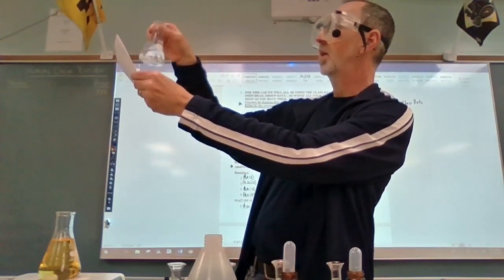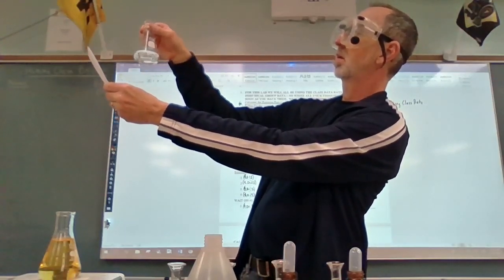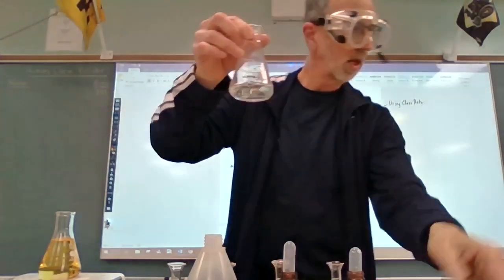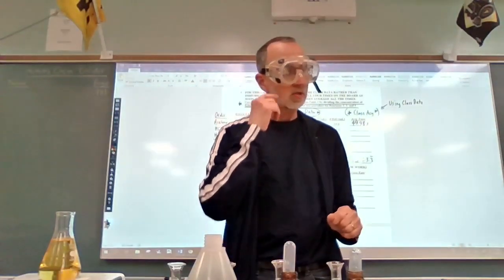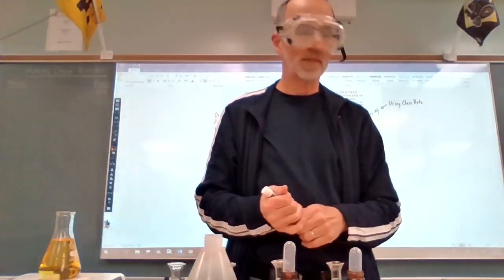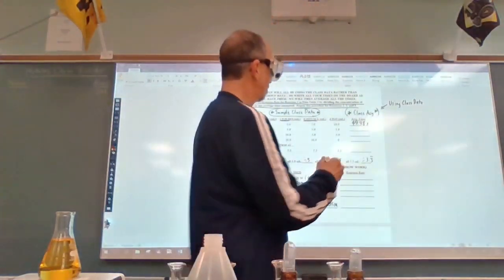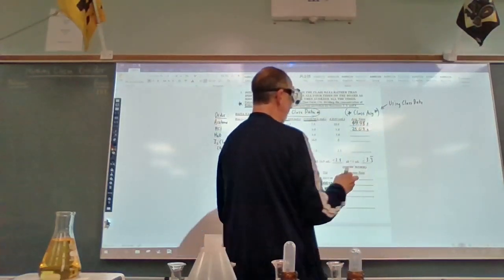Boy, we're getting really close. I think we're there. Boom. Okay, I recorded 27.33 seconds. Again, using the class data from last year, that averaged out to 25.09 seconds.